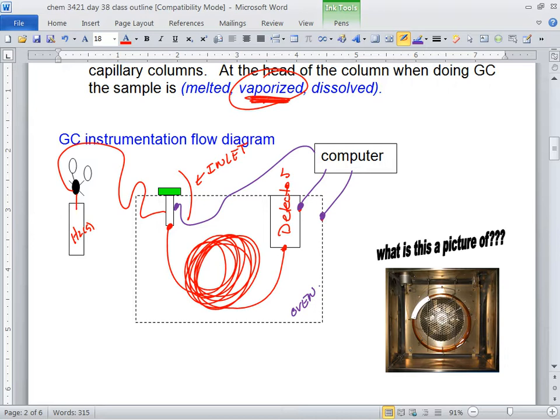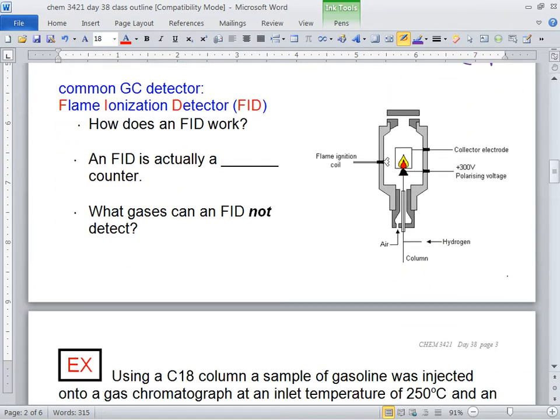Okay, and here's our inlet. Do you recognize the capillary column? Well, yeah, it's that, around the fans. That orange thing. Here's our column, our capillary column. And it's really hard to see. You almost have to be up here where I'm at. Capillary column's coming up, and there it is. It's going to the detector. So it starts over here and ends up going into the detector. So that's the general idea of how a GC works.